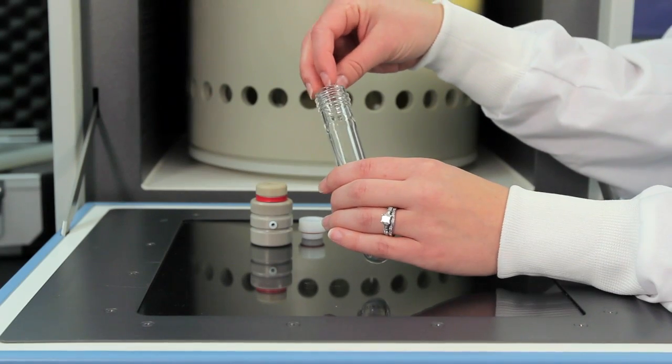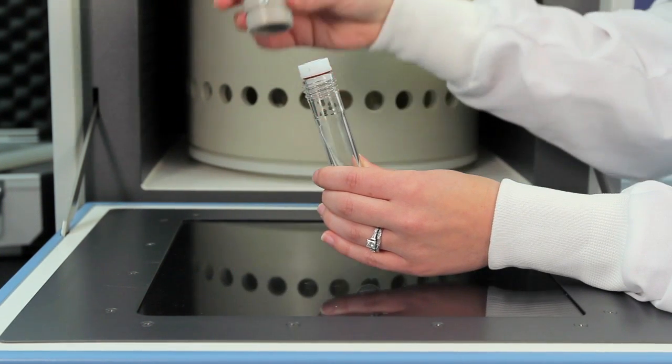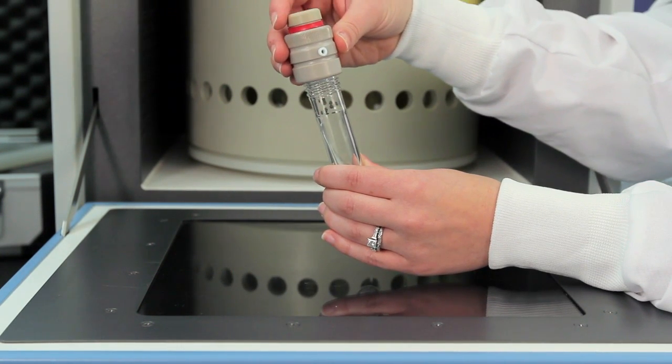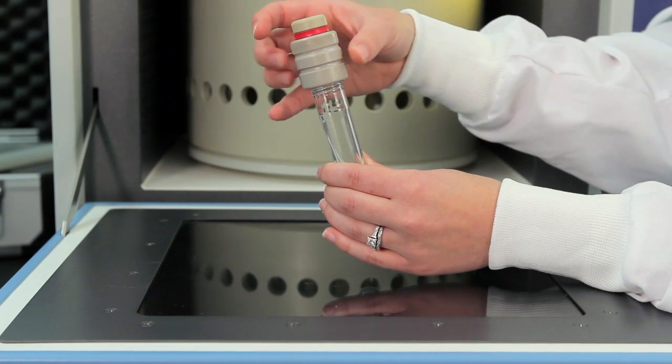Simply add the sample, the solvent, a stir bar, and then screw on the TFM cap. The cap contains a pressure release valve, assuring safe pressure control.